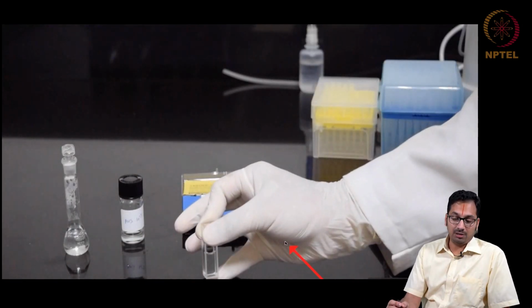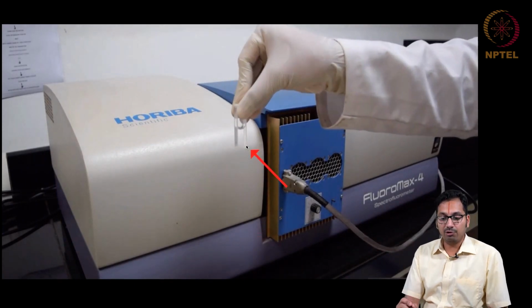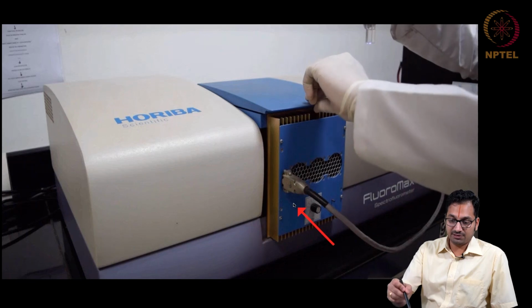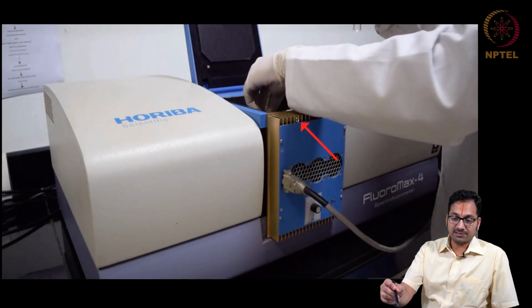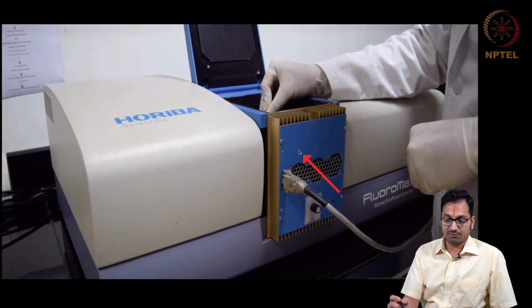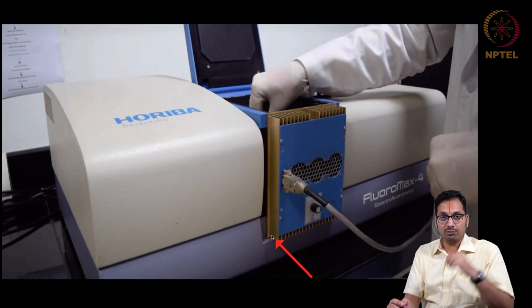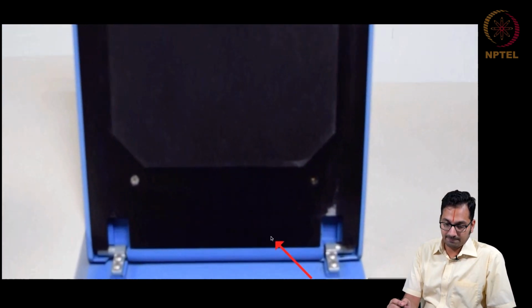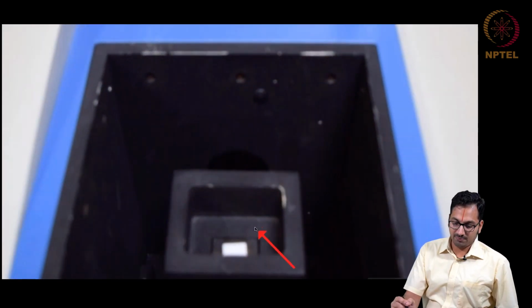One has to ensure that the sides of the cuvette are clean enough before setting up the fluorimetry experiment. And here this is the fluorimetry that we will be measuring our data from. One carefully opens the chamber such that the sample can be carefully input within this fluorimeter. We will also be seeing a top-down view of this so that you understand how the cuvette is carefully placed. As you are able to realize, the cuvette has been placed within the sample chamber.